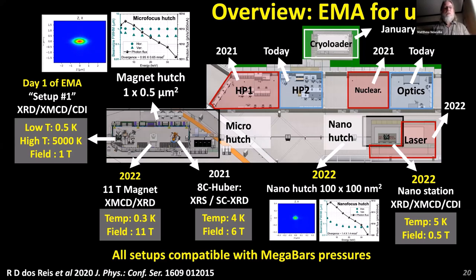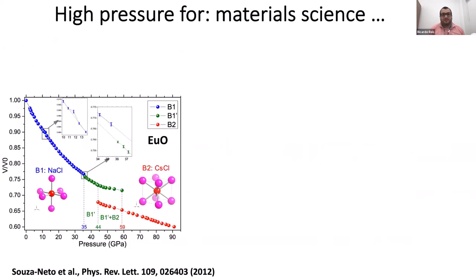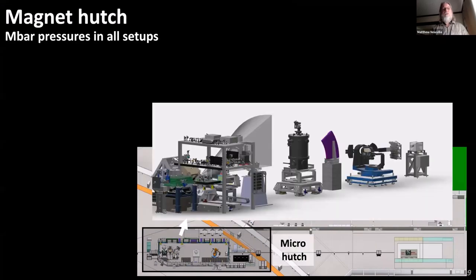Ricardo, I actually have another question for you, from the beginning of your talk. You have a four-bounce monochromator, and then the quarter wave plate. What's the energy range for this beamline? 2.7 to 30 keV. So when you're at very low energies, you're at very high angle on silicon 111. With a horizontal-bounce mono, how much flux do you expect to get through the mono, because of polarization?